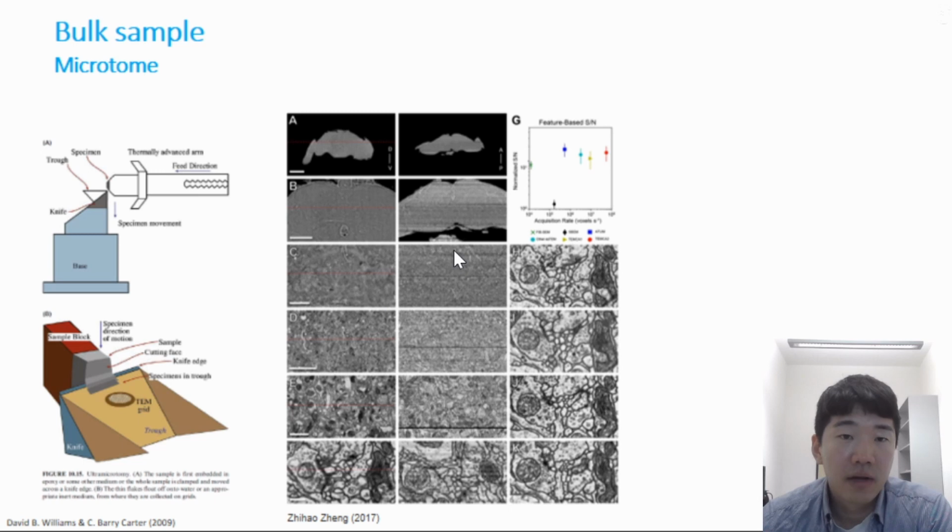The microtome has long been used for sectioning biological materials, and biologists can reconstruct a 3D picture of the biospecimen. In recent research, the brain has been investigated with comprehensive neural circuit mapping. In this work, the biological sample was prepared by a microtome.